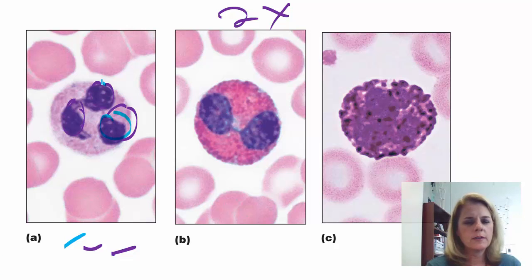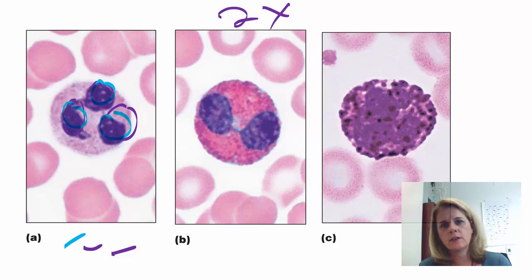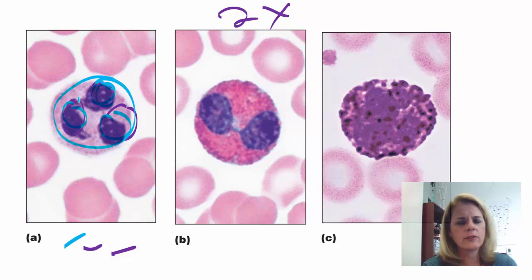If you see a multi-lobed nucleus, that's going to tell you that you're probably looking at either a neutrophil or eosinophil or basophil. But the way they get their names is how they take up the dye. Neutrophils are neutral. These dyes have red and purple in them, so you put red and purple together and it's kind of lavender. If you see dark stained nuclei with a lavender cytoplasm and it looks a little bumpy, that's a neutrophil. The eosinophils take up the red portion of the dye.